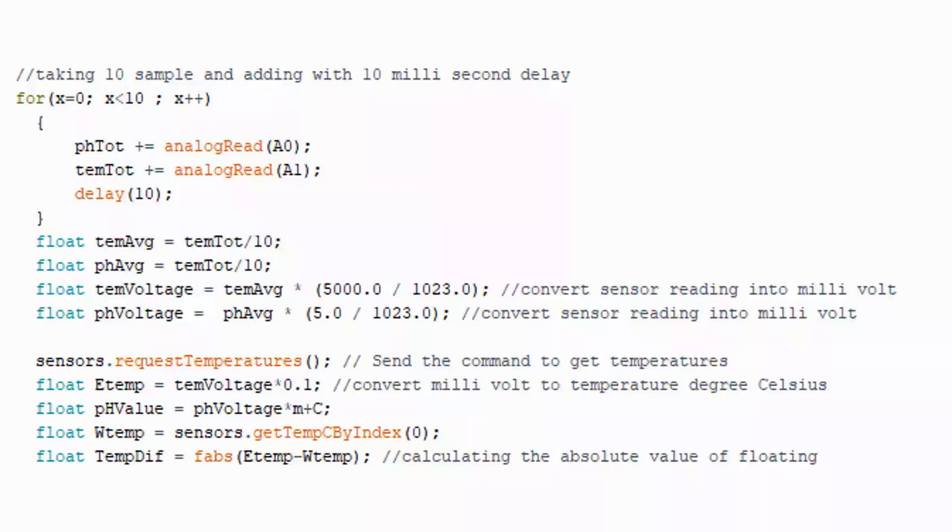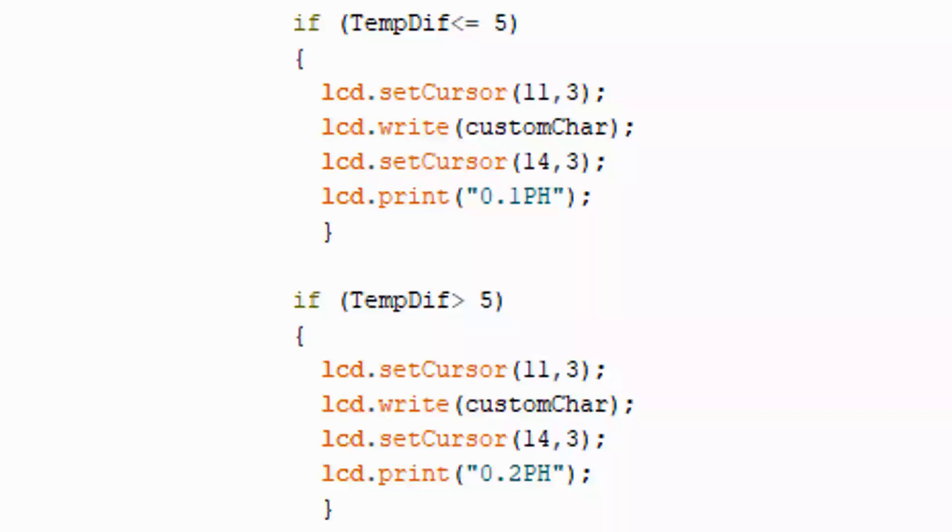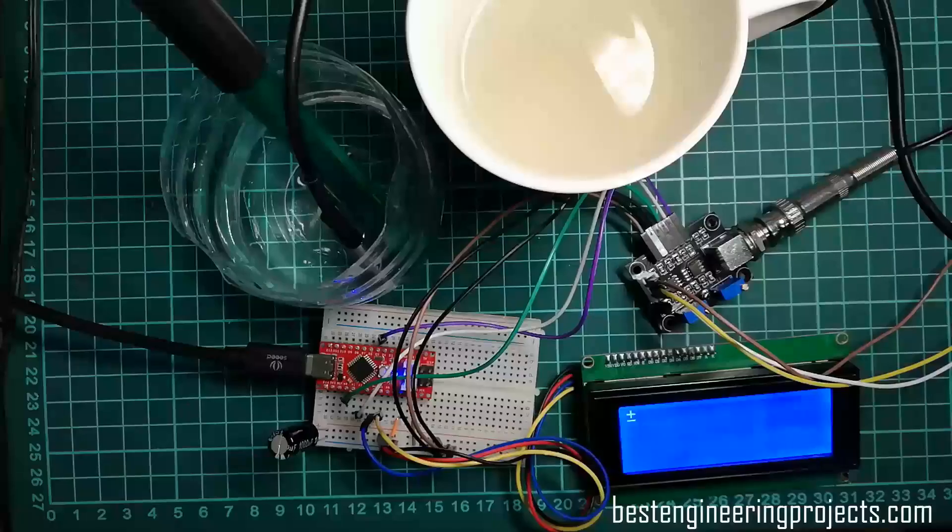Later, we compare temperature of surrounding and solution and further calibrate the pH value. According to the datasheet of electrode, if the temperature difference between surrounding and liquid solution is less than or equal to 5 degrees Celsius, then there would be tolerance of 0.1 pH, that is plus minus 0.1 pH. Similarly, if the temperature difference between surrounding and solution is more than 5 degrees Celsius, then there would be tolerance of 0.2 pH, that is plus minus 0.2 pH.